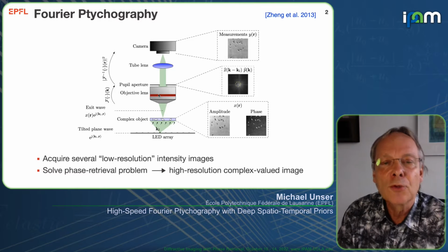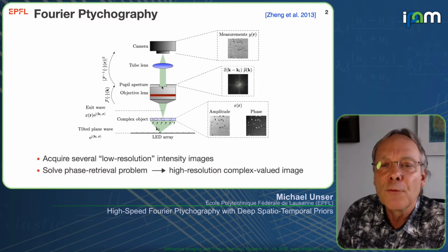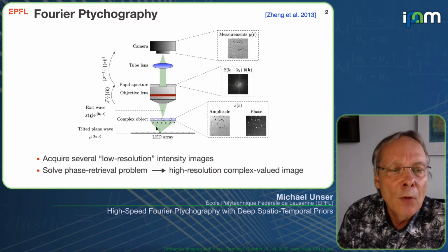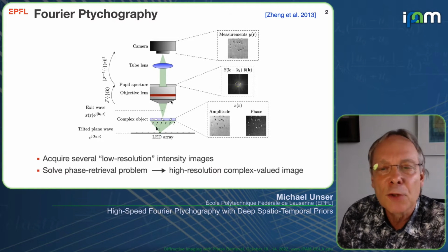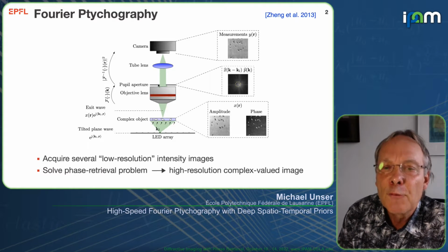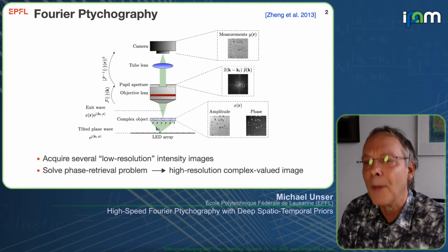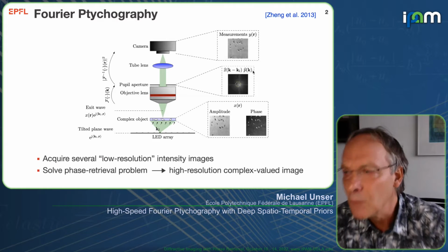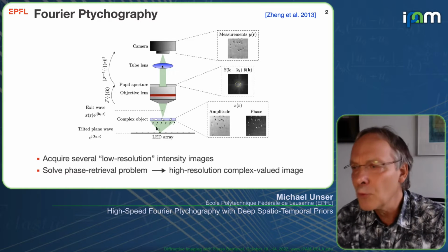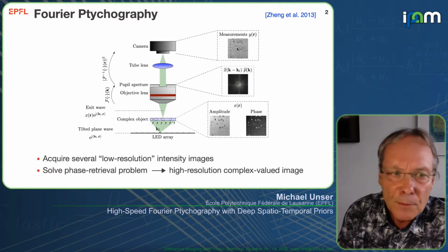Then you have an objective lens of a microscope. If you look in the Fourier plane, what you will have is the Fourier transform of the object you want to recover, but because it was modulated, it will be shifted in Fourier. Then you also have the effect of the pupil, which will do the diffraction limiting of the microscope, eventually also with a phase profile. At the exit, you have again a focusing lens that will do the equivalent of an inverse Fourier transform.